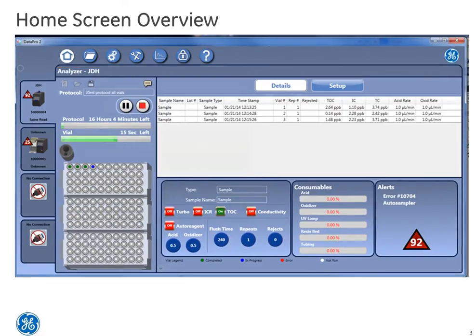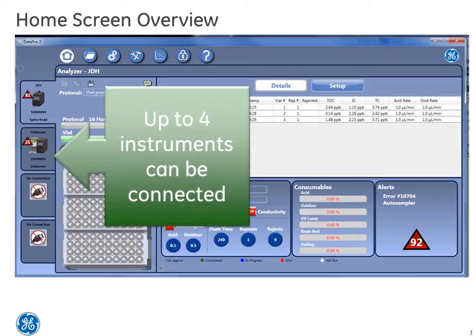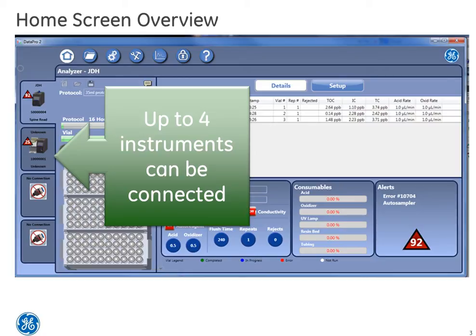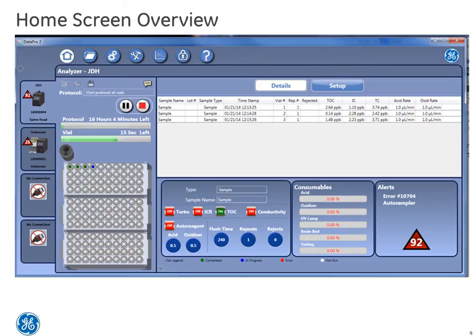With the new software, it is possible to control up to four analyzers and four autosampler systems. But today we have two connected, as you can see here on the left. Now that we are connected, let's look at some of the components on the screen.